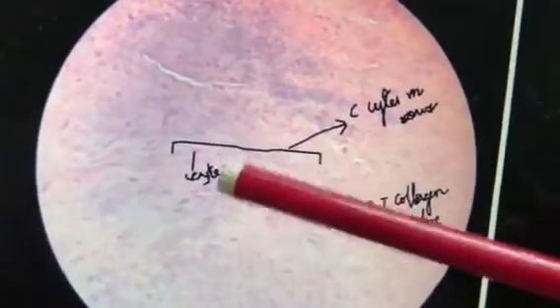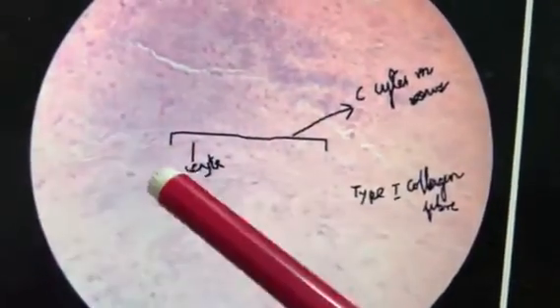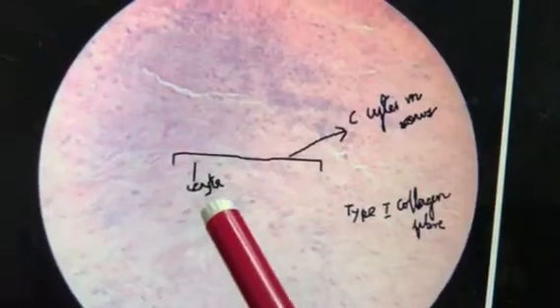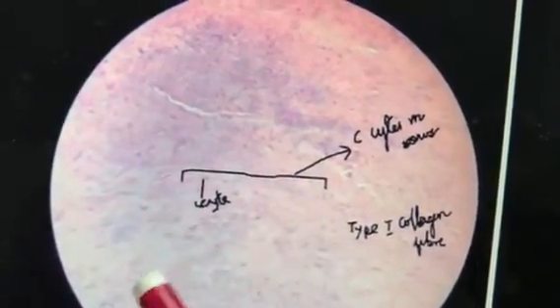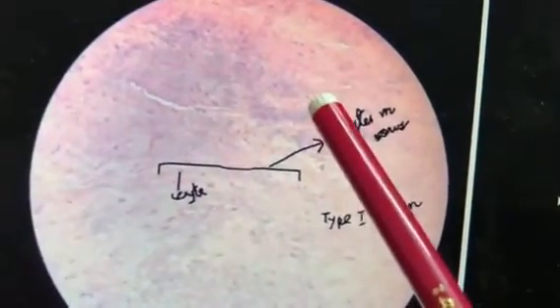And number 3, we will ask this one nicely. You can see the white fibrous cartilage. In white fibrous cartilage, you can see the nuclei arranged in rows. Can you see? It is arranged in rows. You can see here it is arranged in rows. Nicely you can see, because first point, it doesn't contain a perichondrium.